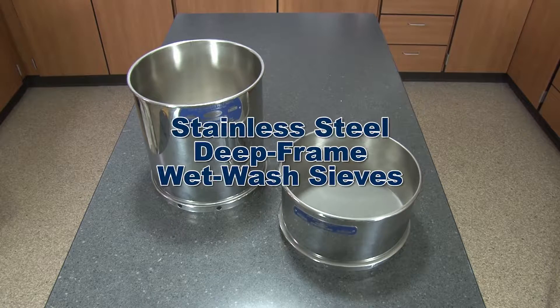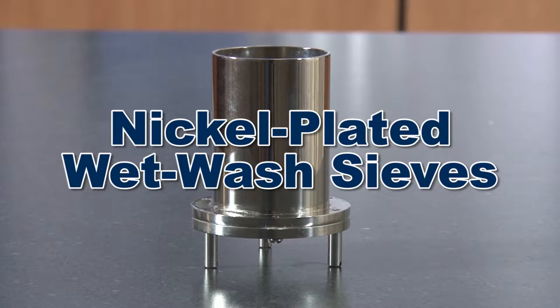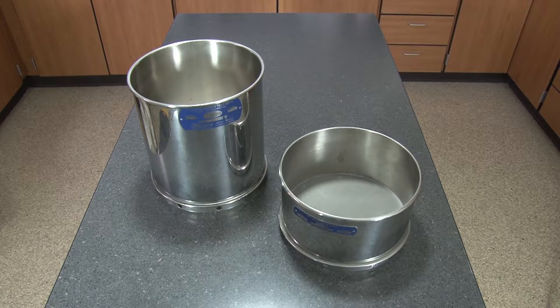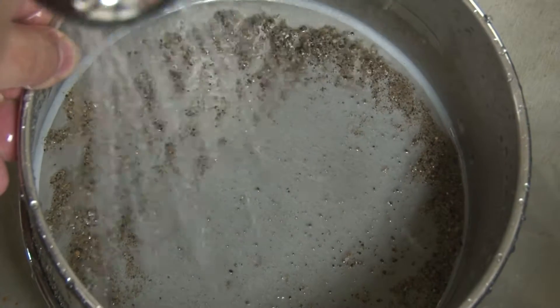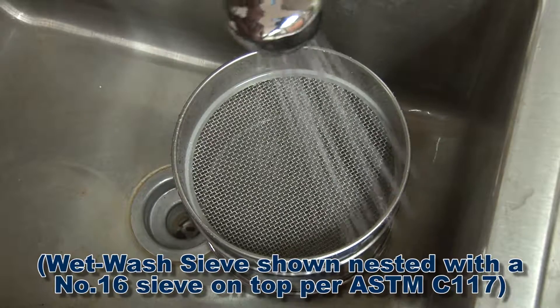Gilson offers stainless steel deep frame wet wash sieves, as well as nickel plated wet wash sieves with replaceable mesh and 8 inch brass frame replaceable mesh wet wash sieves. Stainless steel deep frame wet wash sieves are ASTM E11 compliance grade test sieves and are used for fines content determinations, to wash away excessive fines when preparing specimens, or when handling fragile specimens.